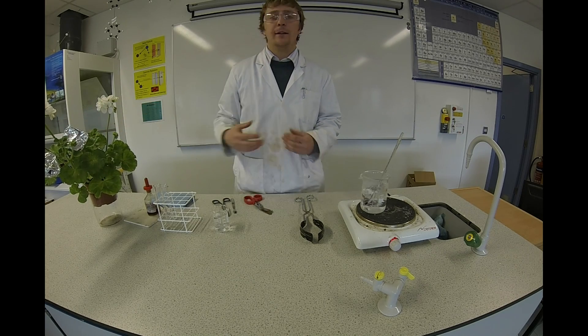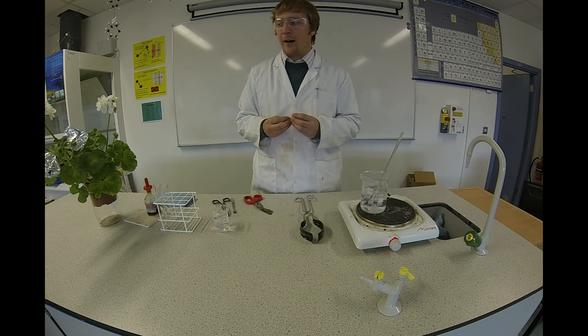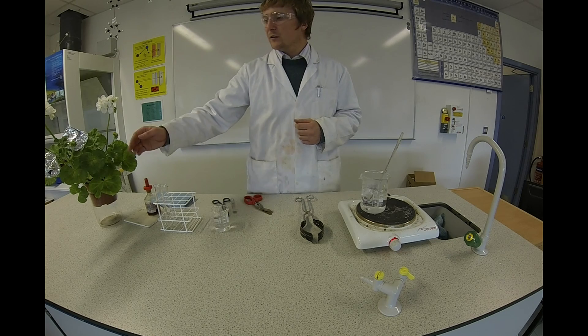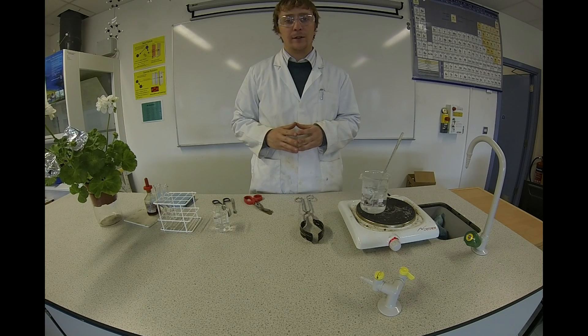When the leaves are covered they don't get any light, so they'll stay de-starched. The rest of the plant was then exposed to the sunlight and allowed to photosynthesize. So there should be starch present in the leaves that were photosynthesizing.